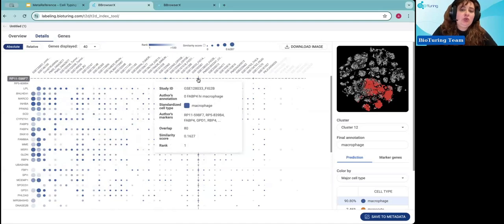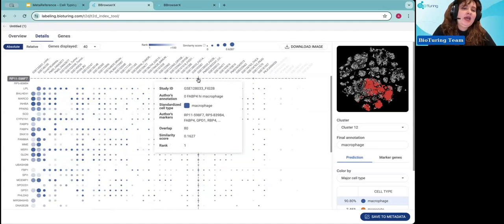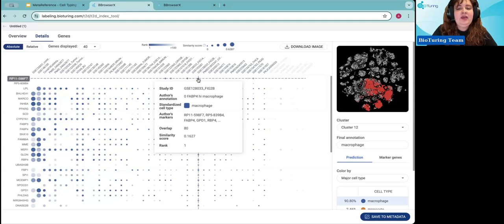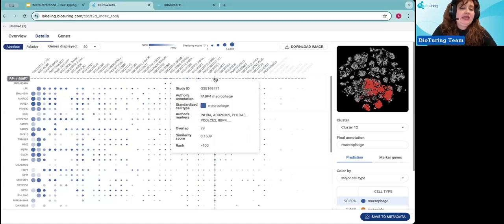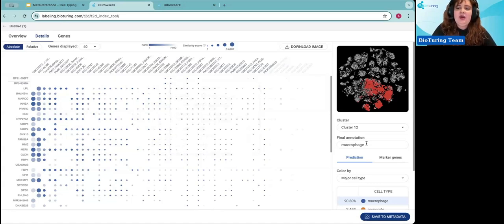Looking at the specific dataset GSE128, it shows that cluster 12 is a FABP4-high macrophage, replicating what the original author annotated, but now seen in the context of other curated datasets. This gives you information related to the overlap and similarity score with the author's original markers. We can also see other datasets that show high expression of this FABP4-high macrophage subtype, supporting your cluster annotation.